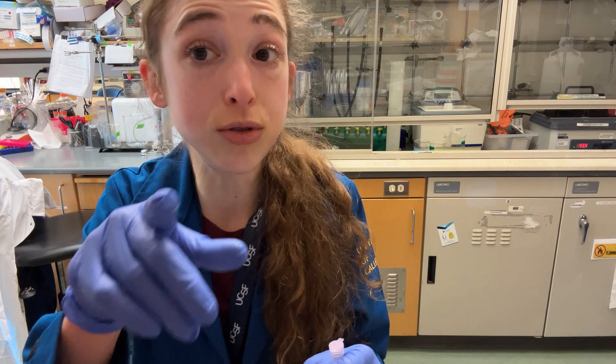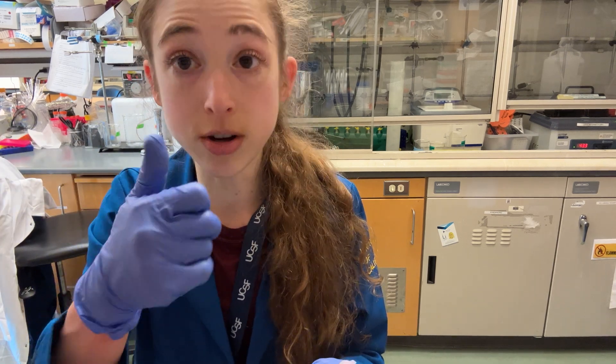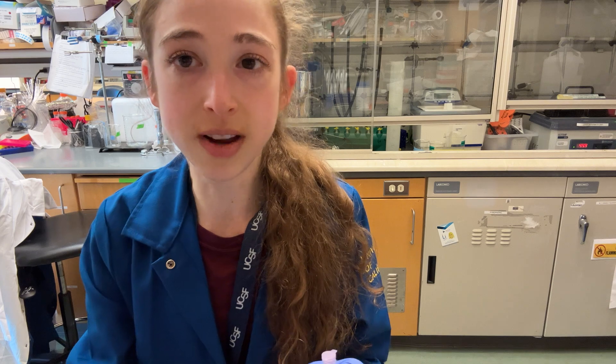Before you do that, make sure you do it at the smaller scale first to make sure it works. You want to see that gel, see the bands look good. And then if the concentration is too low, or you just know you're going to need a lot, go ahead and do those multiple reactions. Because all those tubes should be identical — especially if you mix well when making your master mix — you don't need to run a gel before pooling them. Just pool together the ones that are the same, then run your gel to confirm everything looks okay. You can even be doing your PCR purification at the same time your gel is running.